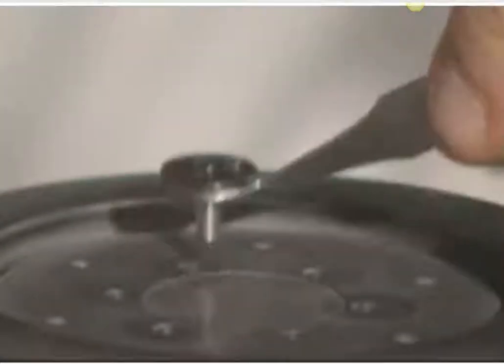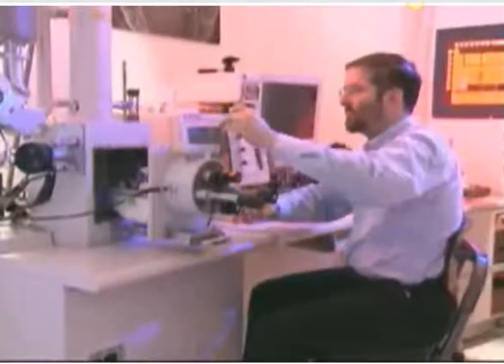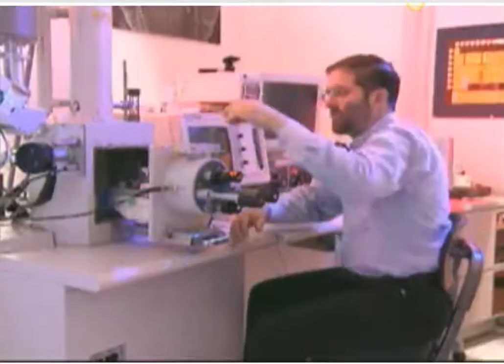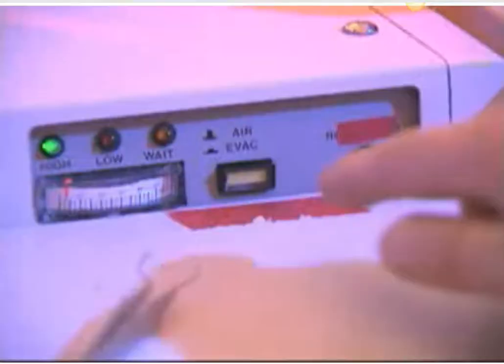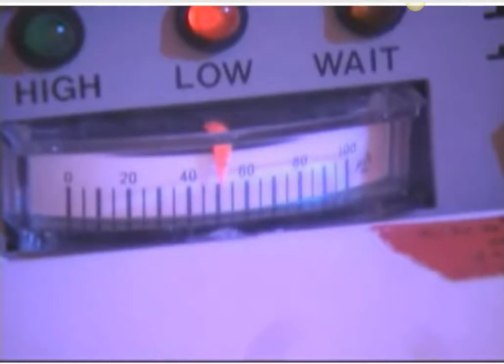The fly is then removed and taken to another room. Here, the microscope chamber is opened and the fly is placed inside on the microscope stage. The chamber is closed and a pump is started to remove all air from the microscope, creating a vacuum condition. Dr. Steve Barlow explains the difference in microscope types.